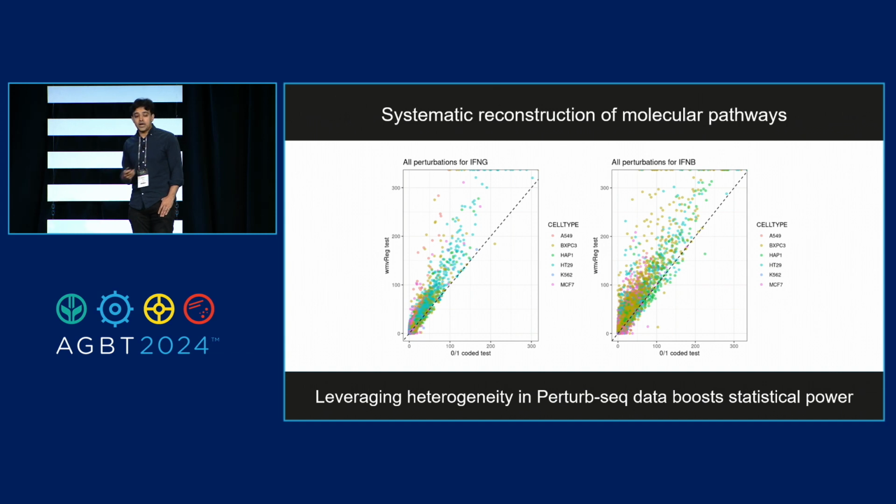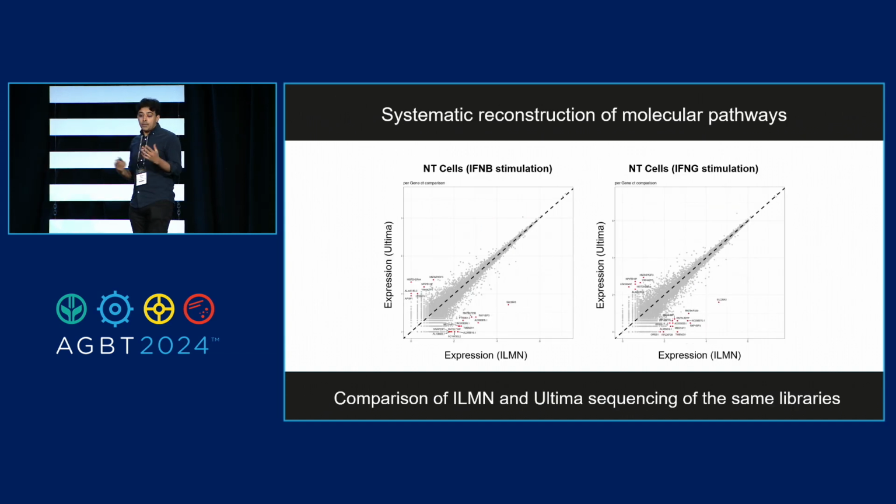So if you're interested, all of this is available online. The mixed scale framework and our differential expression package is all on GitHub and is compatible with our R software package, Seurat. All right, so what about Ultima?